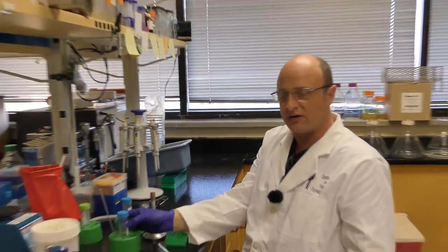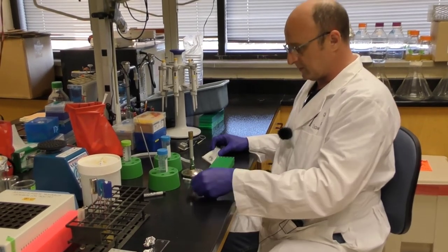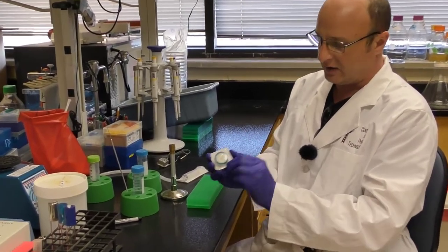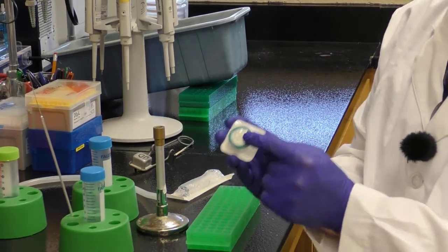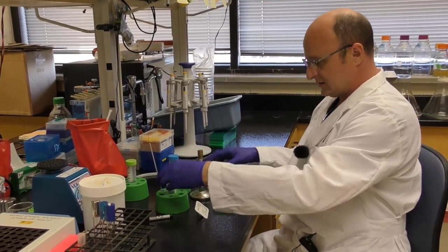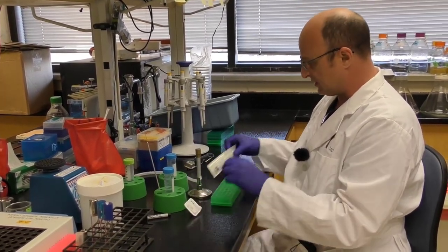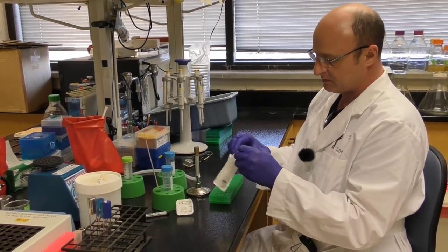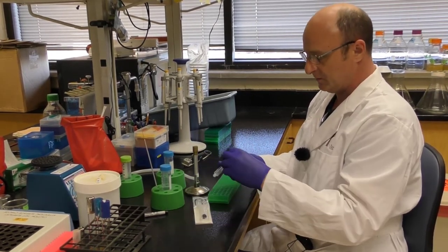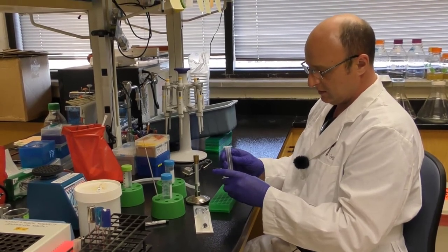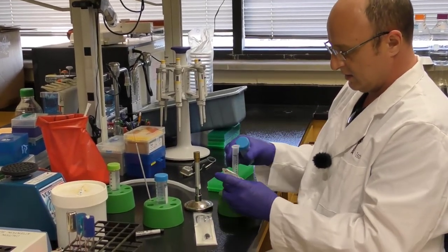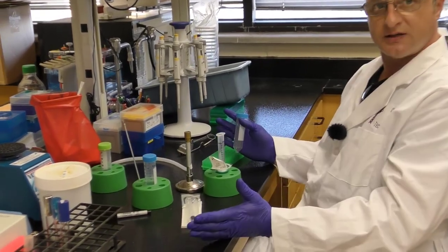And now what we're going to do is filter sterilize it. So we have our filter and we have our syringe. And what's very important with the filter is that right now it's completely sterile, and this tip needs to stay sterile the whole time. So you just need to be careful not to touch that tip once it's out of the bag or mess with it in any way. So what I like to do, actually the first thing I'll do is I'll take my syringe, and we completely remove the plunger, and I place the plunger back in the bag because I know that's a sterile spot. And I could actually leave this here so it stands upright.